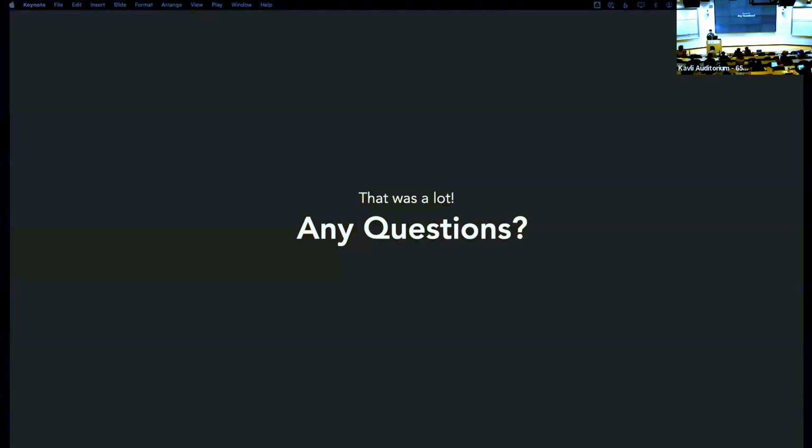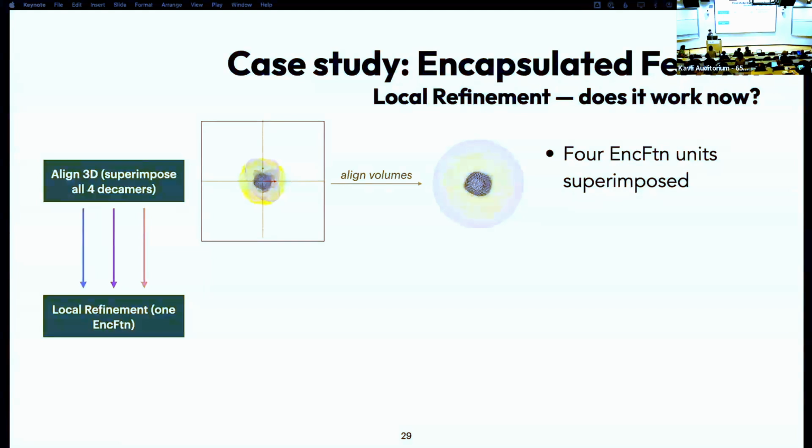Yeah. And I think we'll have time for questions on the earlier stuff at the end. So I have probably about 5 to 10 more minutes of content just to finish off this case study. And then we can take questions about anything that came out through the day from this case study, anything before. But yeah, let's get to some structures because this has been a lot of data processing.